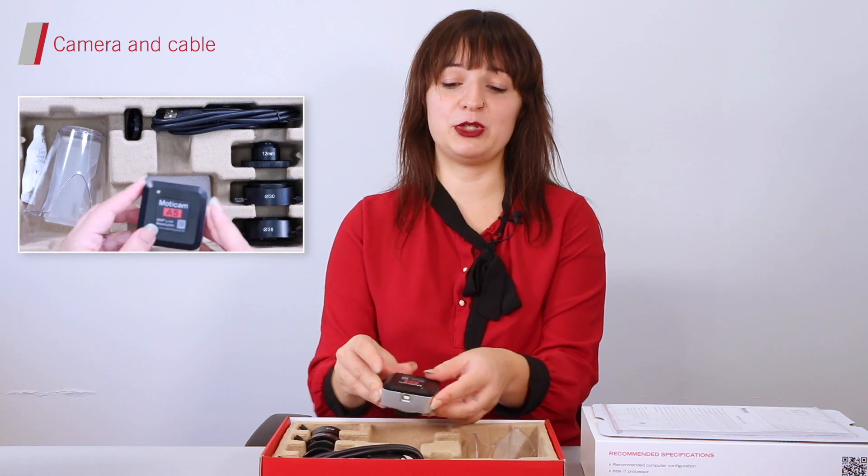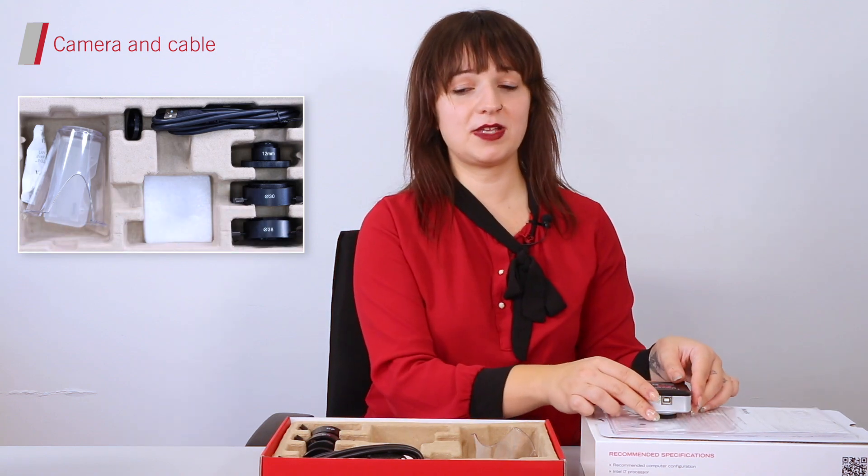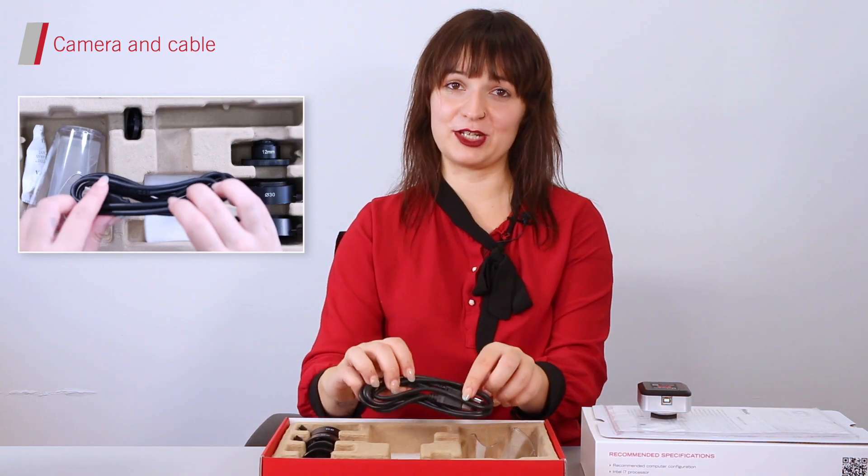Let's go to the star of the show: your Moticam A built-in metal, which you will find at the center of the box, right below its USB connection cable.